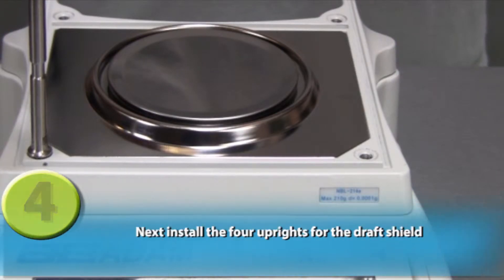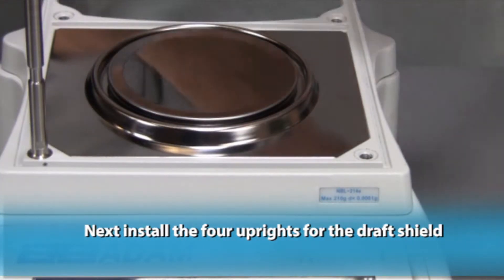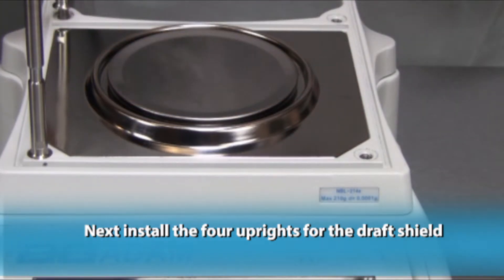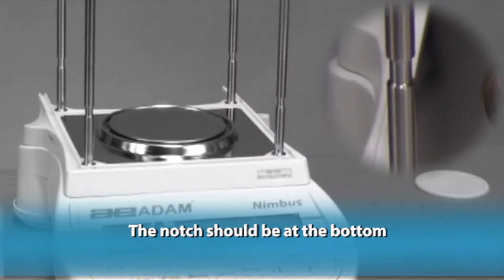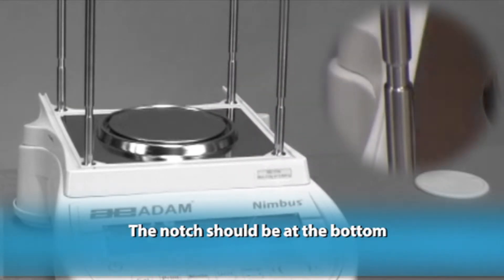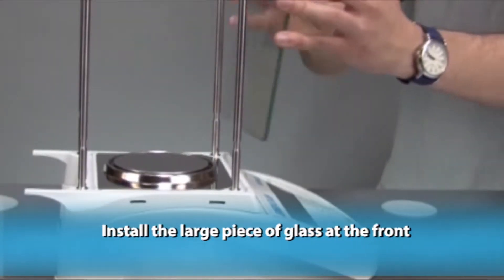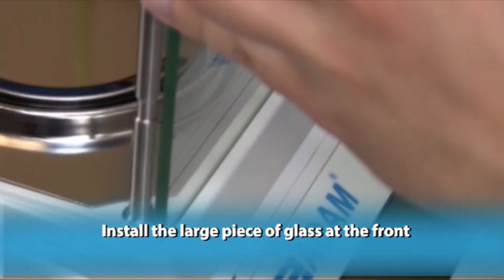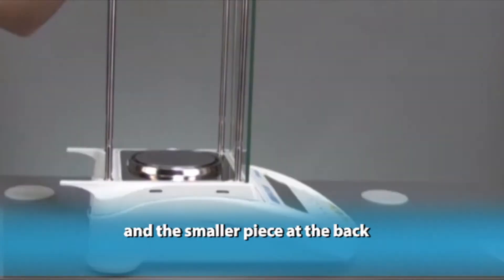Next, install the four uprights for the draft shield. The notch should be at the bottom. Install the large piece of glass at the front and the smaller piece at the back.